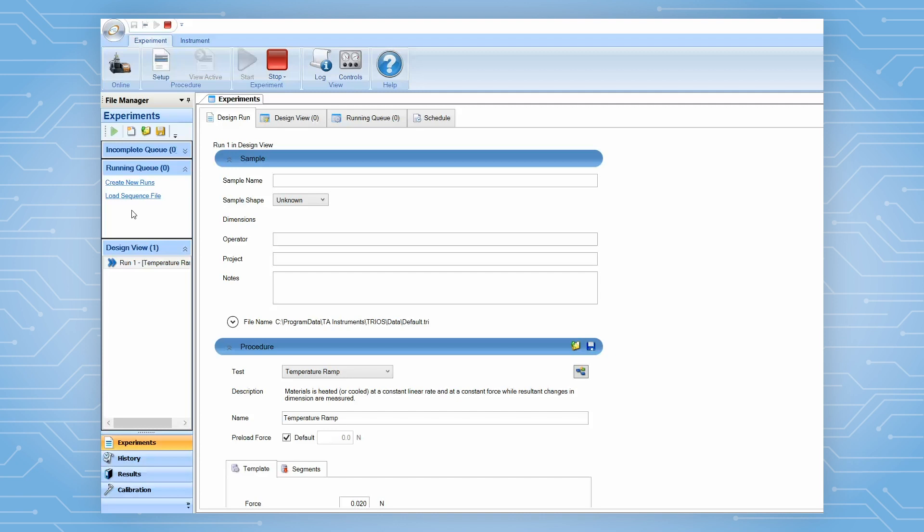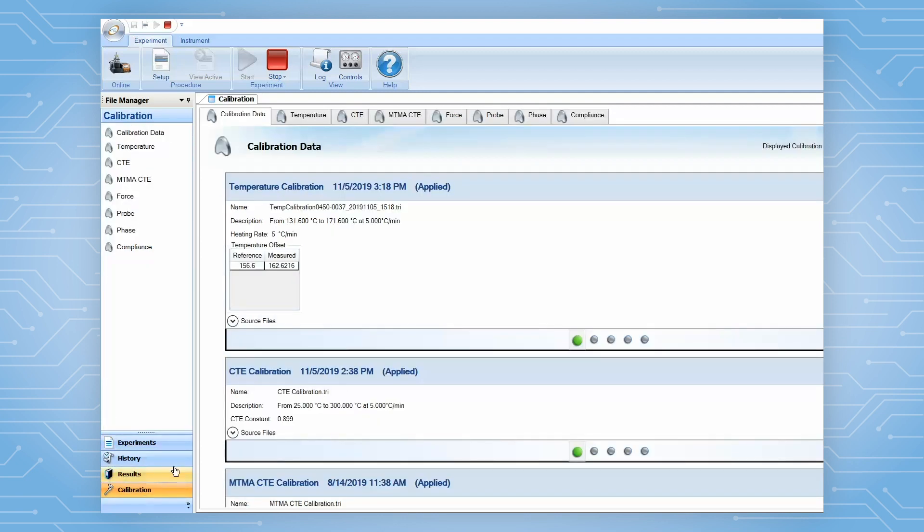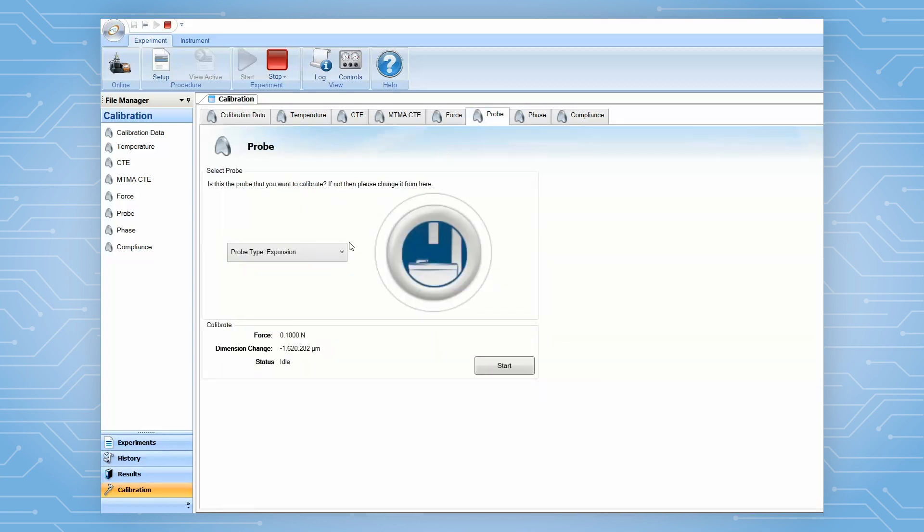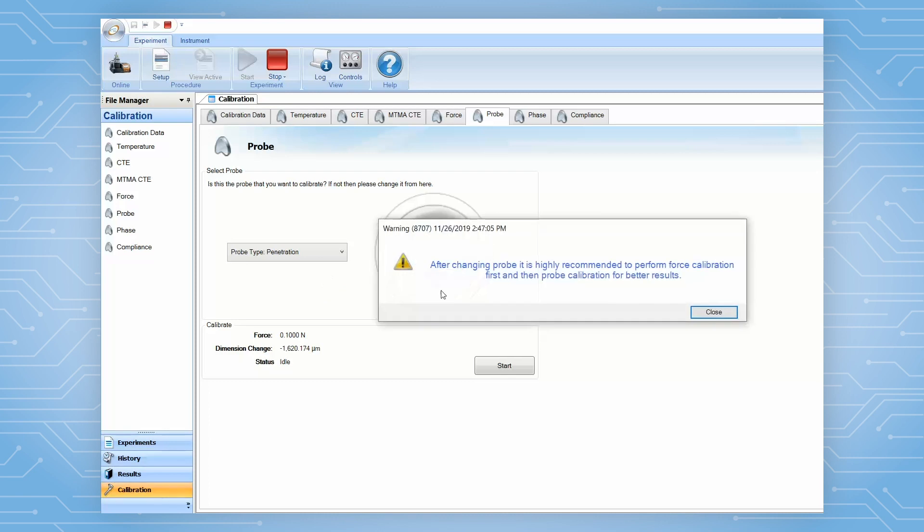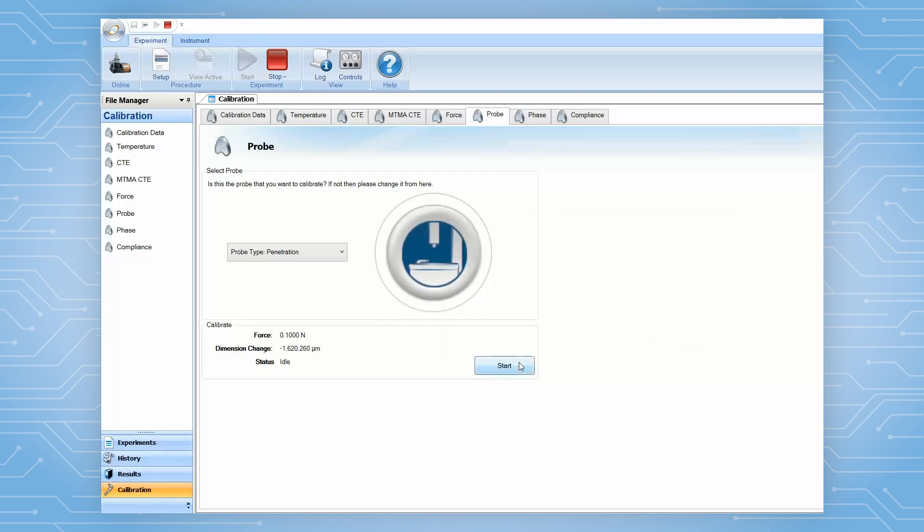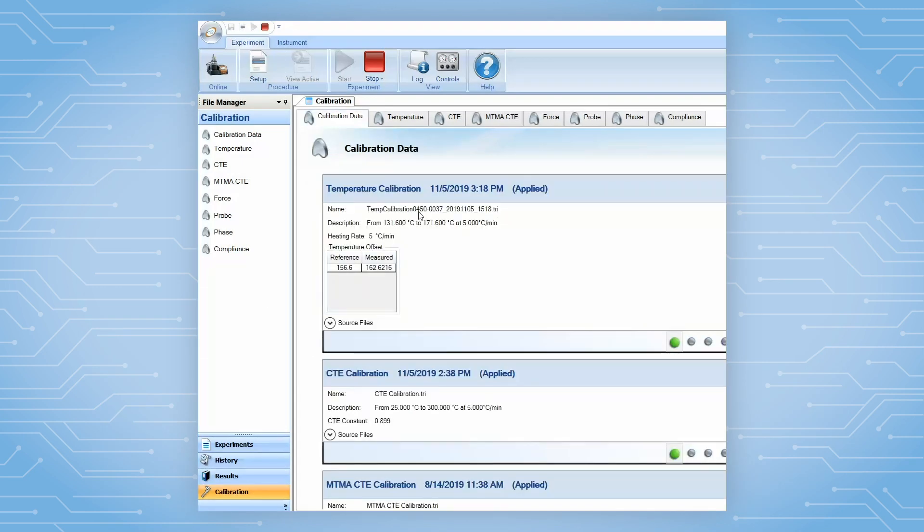You can also calibrate the probe from the TRIOS software by going to the File Manager Calibration panel, clicking on Probe tab, selecting the type of probe you will use, and clicking Start. When the probe calibration is complete, you can verify it on the Calibration Data tab.